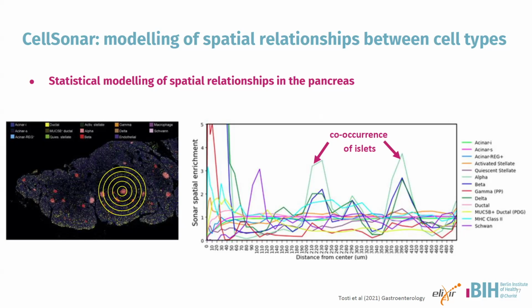One of the things I like about this is that this was a method that was actually developed for cell segmentation-free analysis first back in 2021, and then re-implemented for cell segmentation-based analysis. So it was put into ScanPy after it was cell segmentation-free.